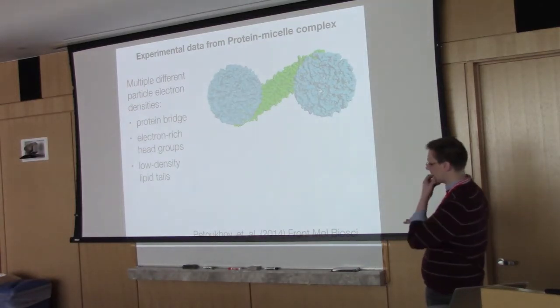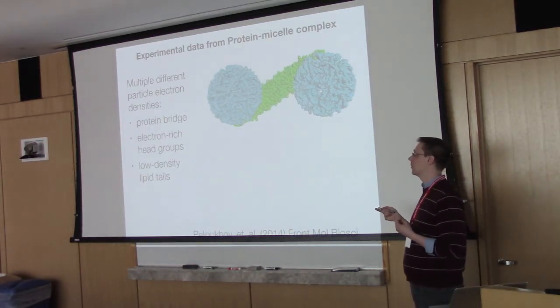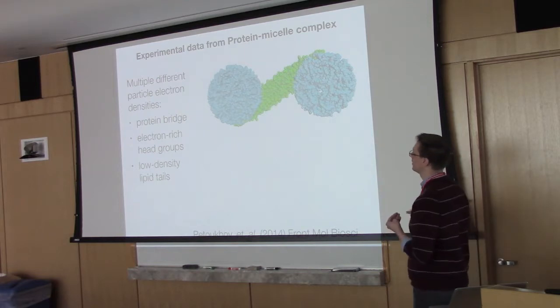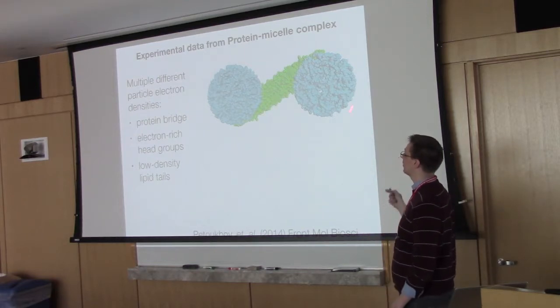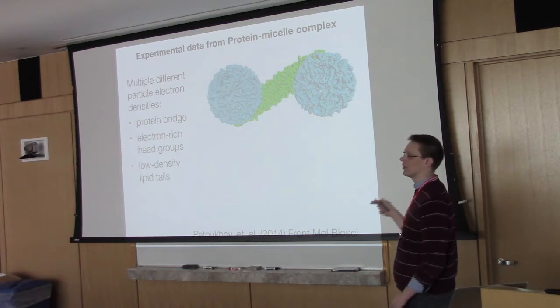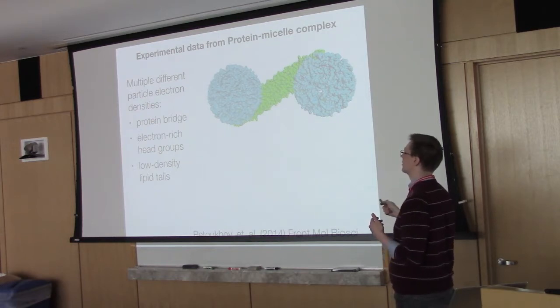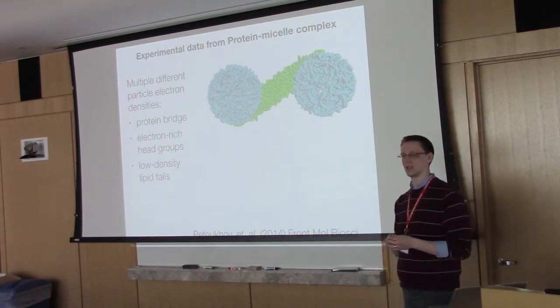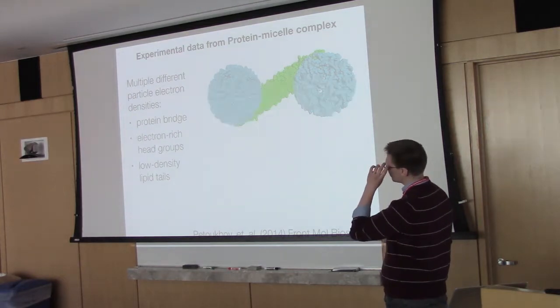And so in this particular case, I found some experimental data, and this is available on the public SAS biological database. It was a really nice case because not only is it this dumbbell shape, it's a relatively complex shape for SAXS to reconstruct. It's not just a blob that you can fit anything to. It's a relatively well-defined shape that is pretty unique.